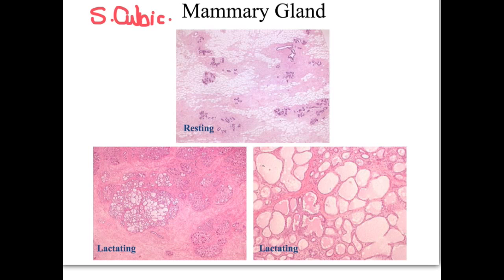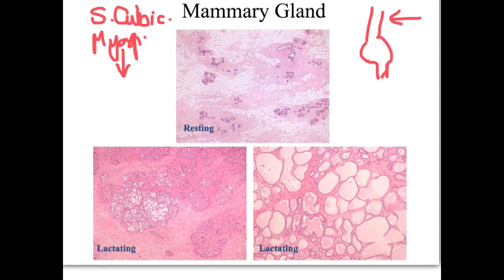epithelium, and it is surrounded by myoepithelial cells. This as regards the ducts. And then it is changed into lactiferous sinus. Here we have a duct, and we have a dilated part called lactiferous sinus, and then a terminal part that will open finally on the surface. So the duct is lined by simple cuboidal epithelium with myoepithelium, while the lactiferous sinus is lined by stratified cuboidal epithelium.